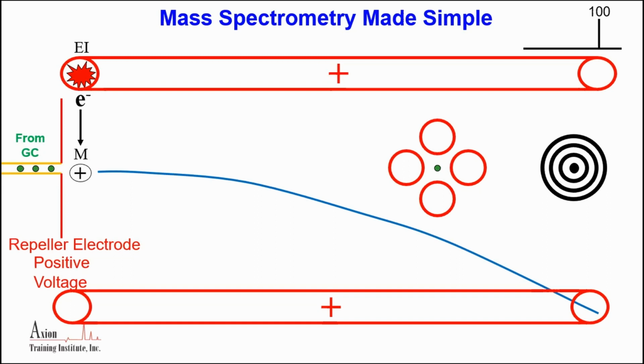So when the detector is hit, it asks the quadrupoles, hey, what molecular weight were you just set at? And it tells us what molecular weight it was. So essentially it puts a spin on the molecule, and at a certain molecular weight, only one molecular weight at a time will be stable. So we often call this a mass filter, because that's what it does. We create all the masses up front at the very beginning in the source, but this filter says no one gets through unless you weigh exactly molecular weight of 2, and then no one unless you weigh 3, and no one unless you're 4, 5, 6. It goes all the way up. So when something gets hit, it just looks to see what number it was at.